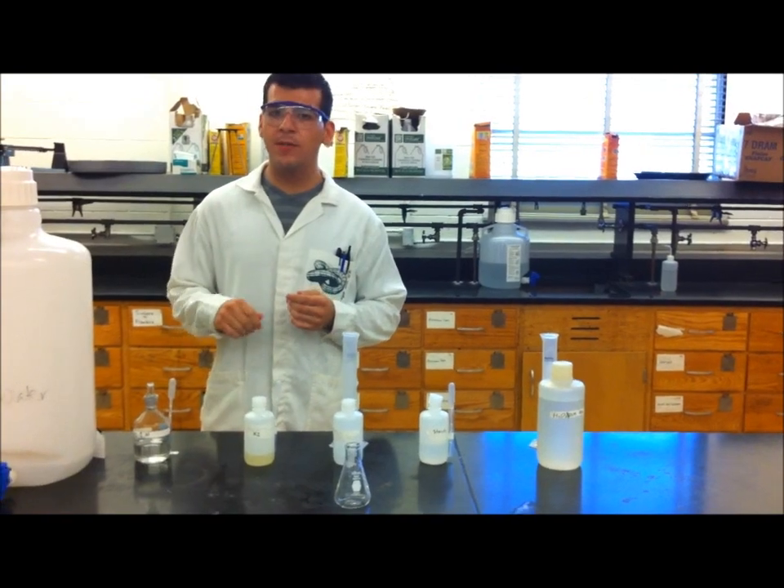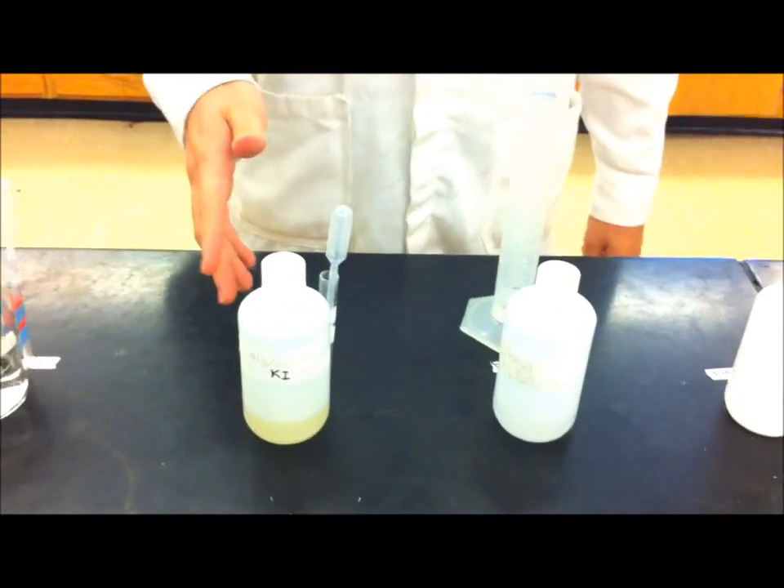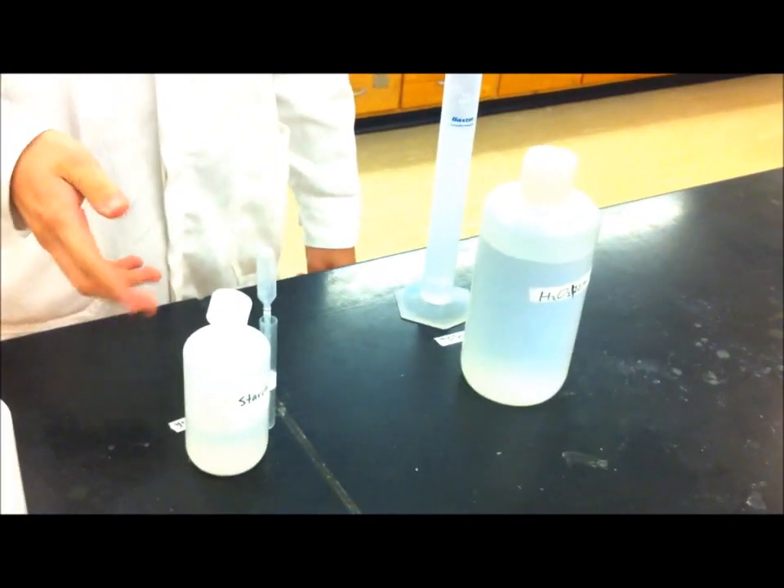For this experiment you will need the following chemicals: one molar hydrochloric acid, potassium iodide, sodium thiosulfate, starch, and hydrogen peroxide.